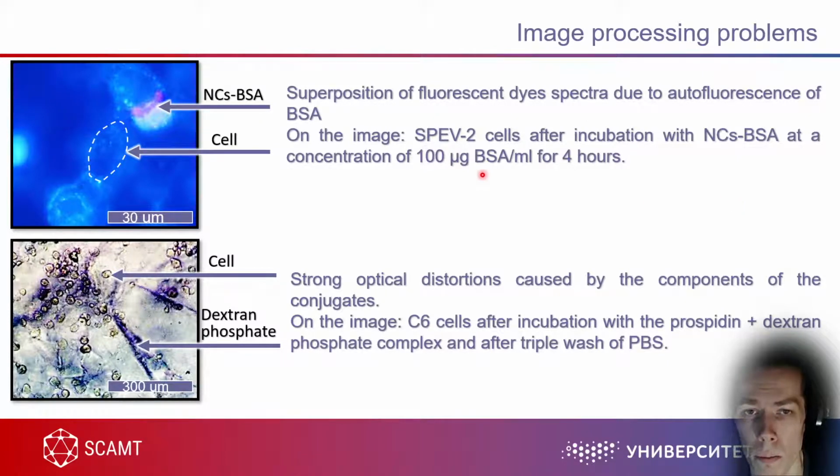Because, for example, in case of poor staining, when you have some strange dyes, and again nanoclusters, as in these pictures, you can see here it's a cell, but it's me who sees the cell. And what about machine learning? Would you be able to adjust your scripts to see the cell or not because of poor staining? It's like maybe a couple of endosomes inside.